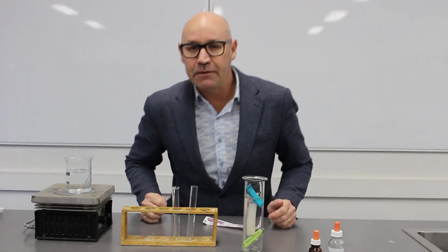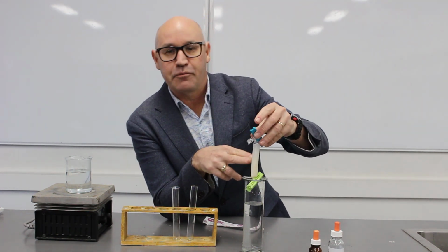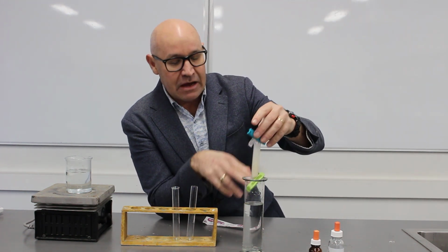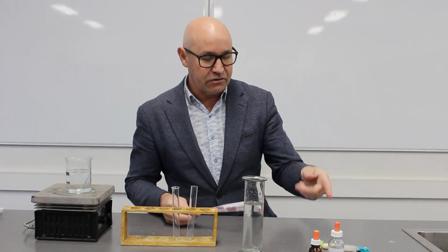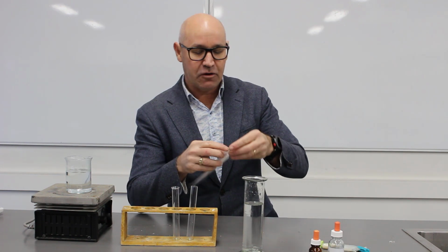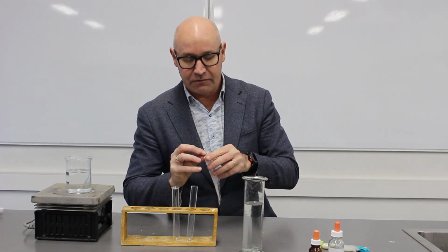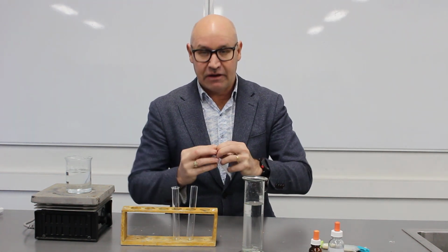Okay, so 24 hours later, we've had our dialysis tubing with our bread mixture in the water for 24 hours. Now we're going to test the water that was surrounding our tube. Now, we need to use an absolutely brand new transfer pipette. If we use one that's been used before, we could get a false positive. That means saying something's there when it's not there because it's contaminated.